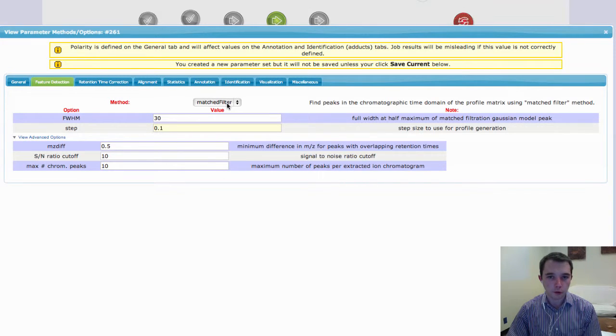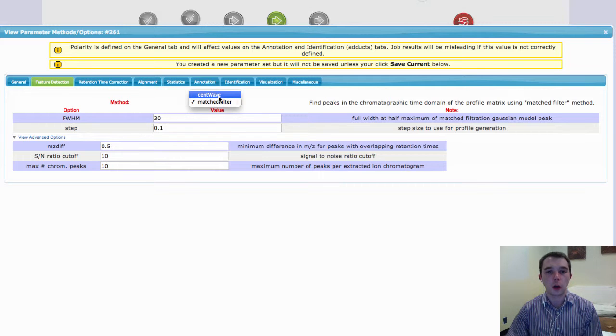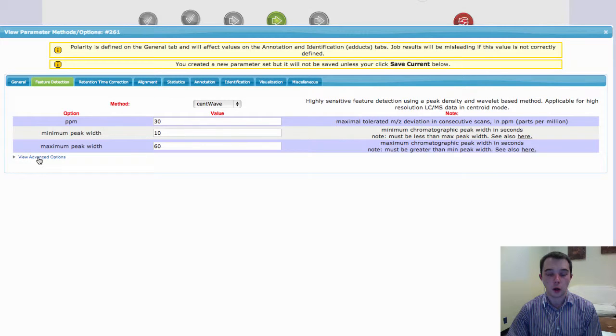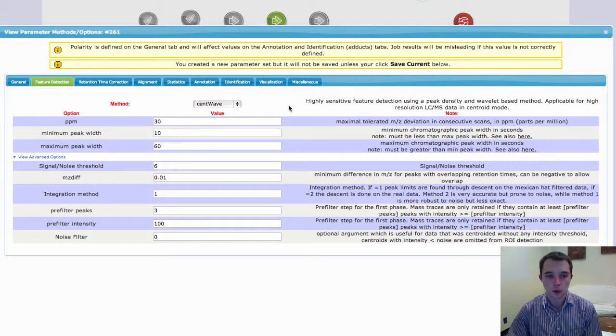So if you have high resolution data, I highly recommend trying to get that data into some sort of Centroid data set before you upload it.